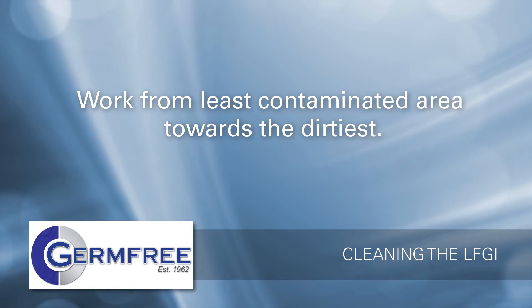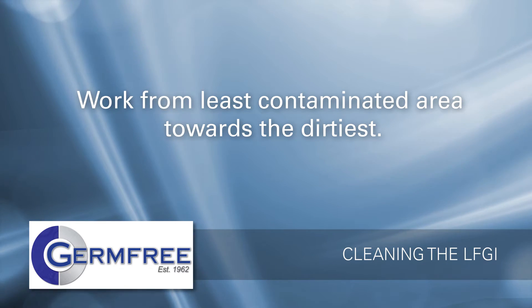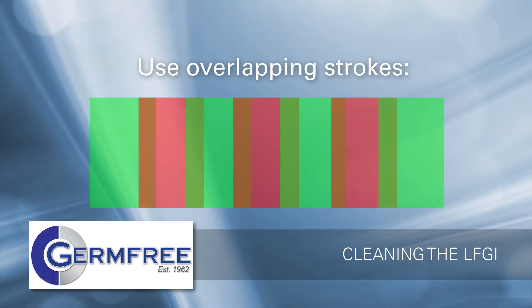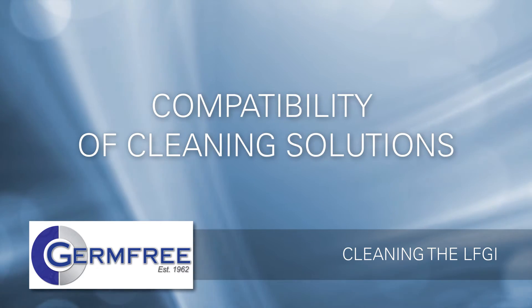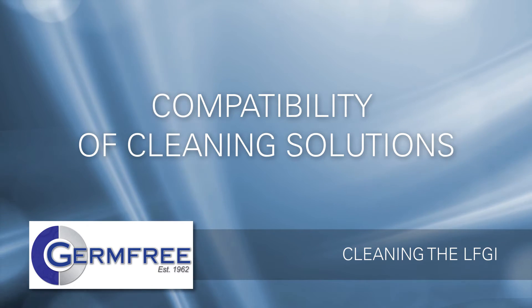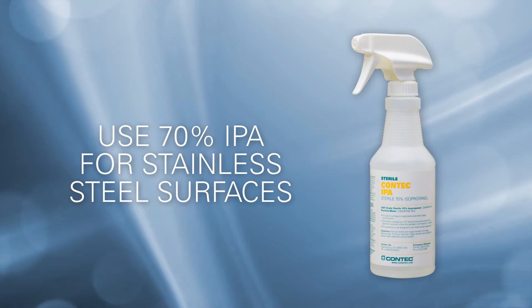To get the best results, start cleaning in the area with the least contamination and work your way toward the dirtiest. Use overlapping strokes to ensure that you don't miss anything. Your LFGI is designed and built to provide many years of reliable service when properly maintained.